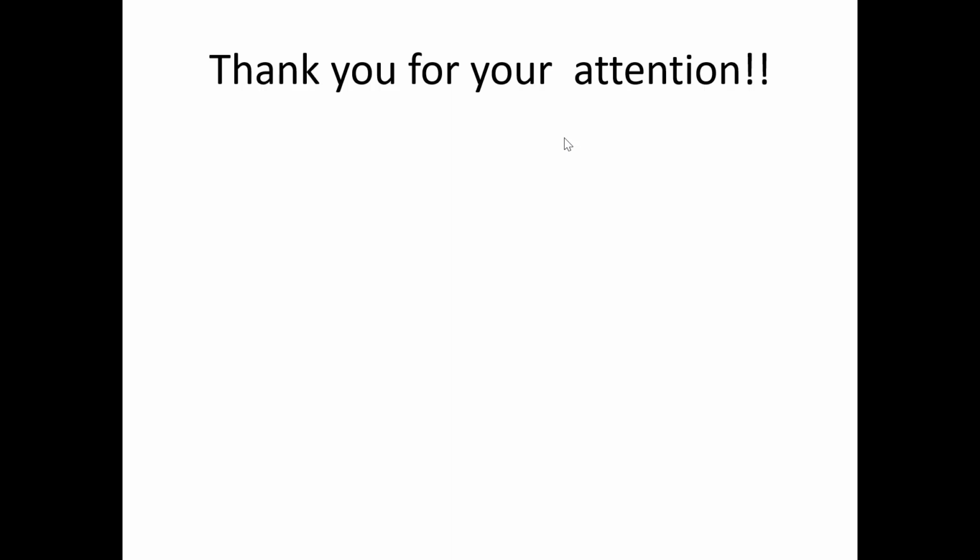And I'm sure there are other issues, but the instruments also get a lot better. The resolution gets better, which helps the accuracy of the results. So major variability is at the sample prep level now, more as compared to the technology. I think this is the area where presently the most gain could be made. When you have 200-300 samples, let's say tissue samples, to process them in a way that they really are consistently processed, I think is still a challenge.